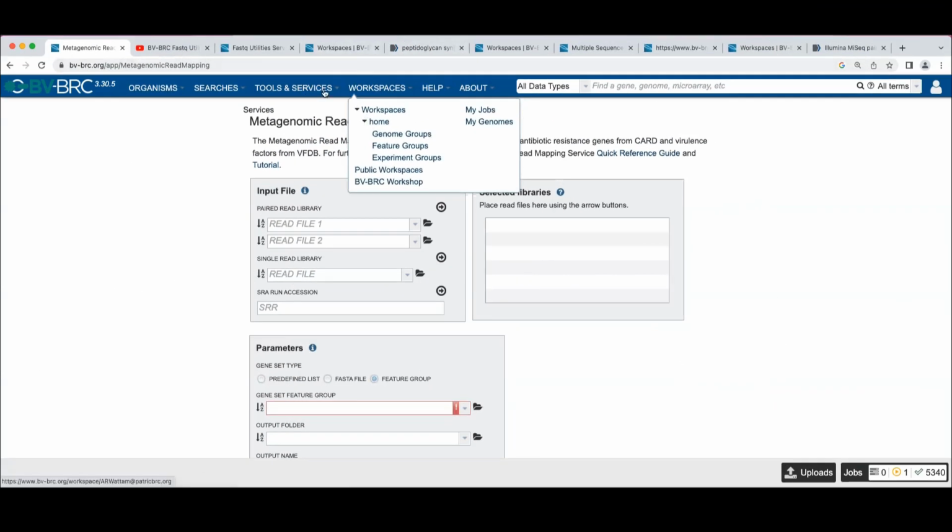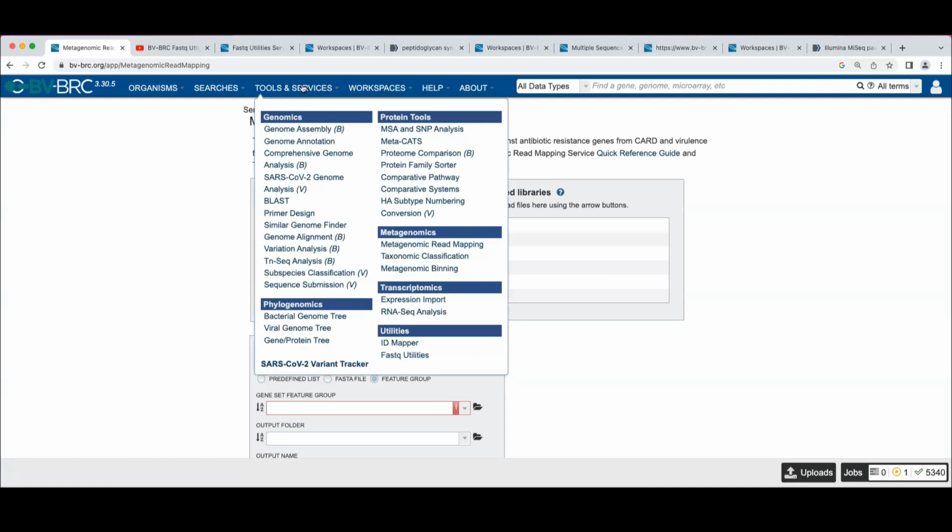We're going to look at now our read quality and manipulating reads. I used to just take whatever I was given, submit it for assembly and annotation, but I'm becoming a more sophisticated user and trying to remove contamination and massaging my reads before I do anything to them.